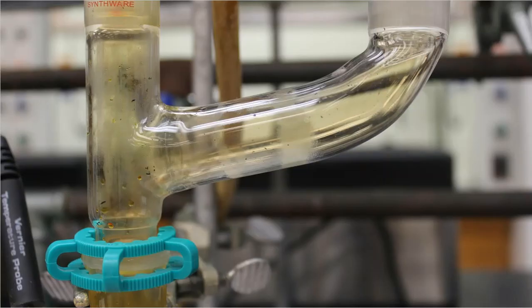Here's a picture of the Claisen condenser. The reason I took a picture of this is because I wanted you to look at the inside of it. It does look like there's orangey, brownish vapor that's starting to fill up the Claisen, and this is perfectly okay. It's what it's supposed to do.